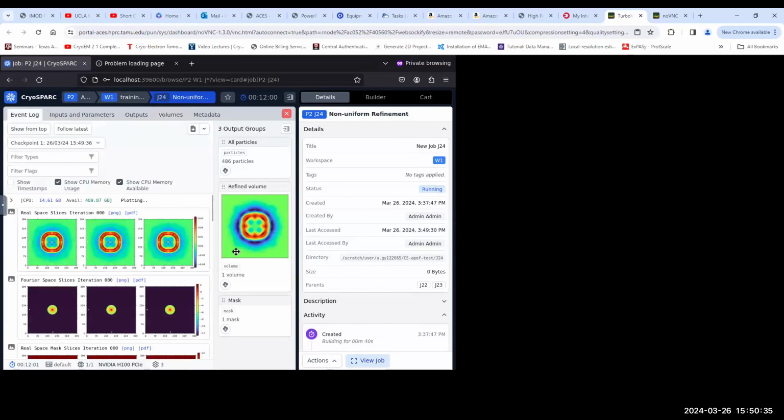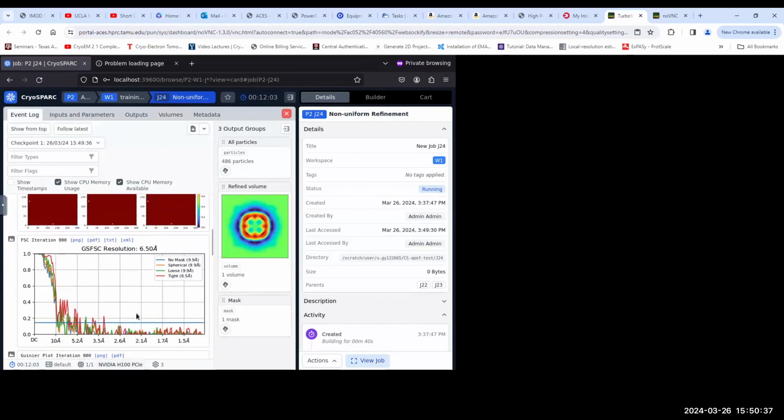Okay, so that should give you... You can see here already the FSC plot is more than 1.5 angstrom. So that's what you need to present. Because if you go back and extract the particles at the full resolution, meaning the pixel size is 0.326, then it will take even longer, but your FSC will go to 0.6 angstrom.